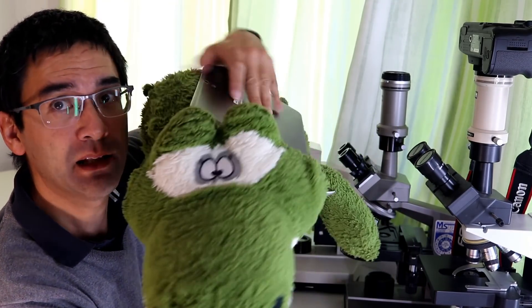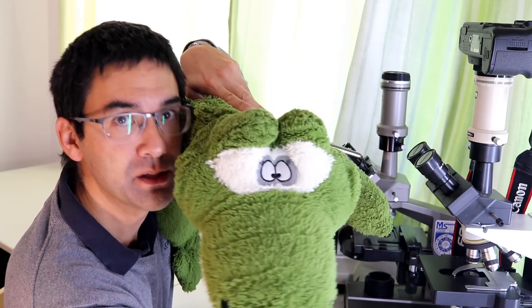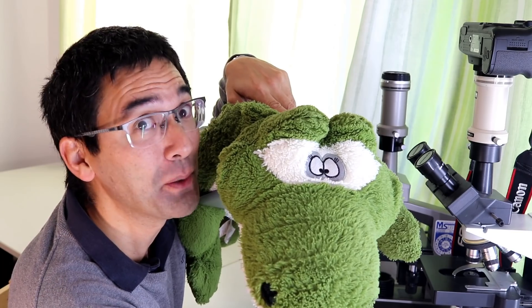Now imagine that the pressure is so high that the poor little Paramecium dies. Well, this is something that I'm going to show you now under the microscope.